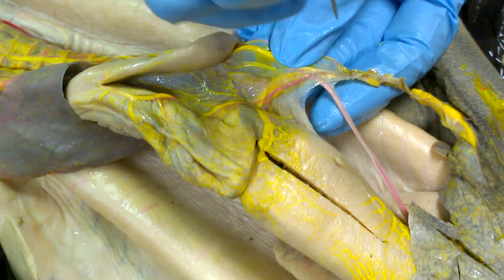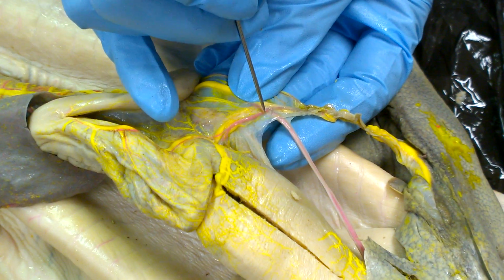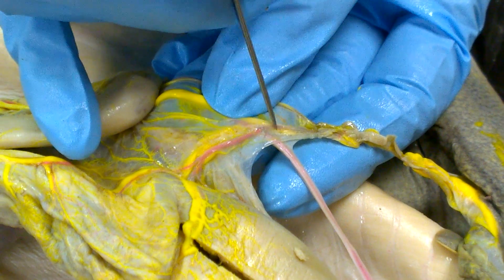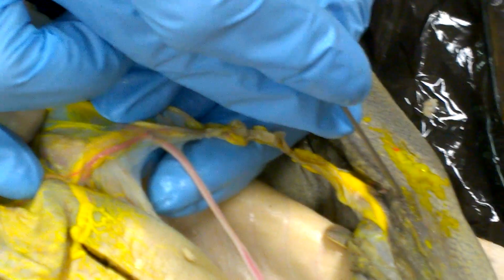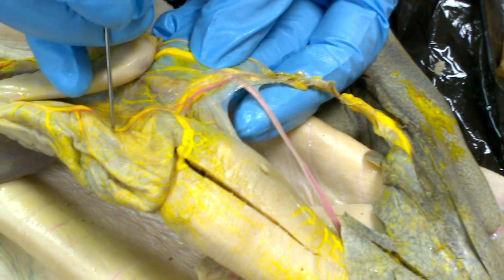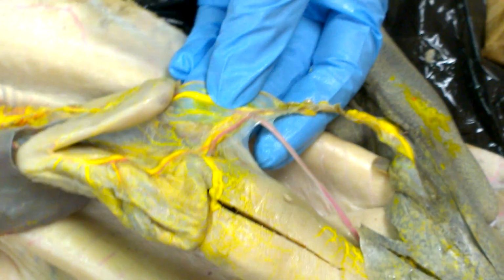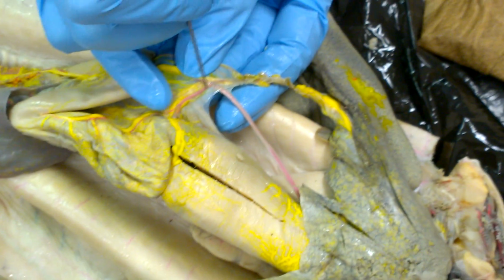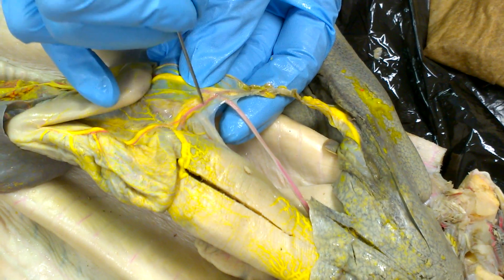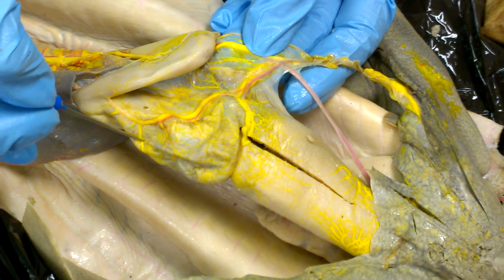I'm not going to pin it and ask you what it is because it's really little. So the gastrohepatic artery immediately branches into this one that runs up toward the liver. The hepatic. Perfect. And this one that runs over to the cardiac stomach. Well, this little short one is called the gastrohepatic artery. So if this one's the hepatic artery, excellent, the gastric artery. So over to the cardiac stomach.